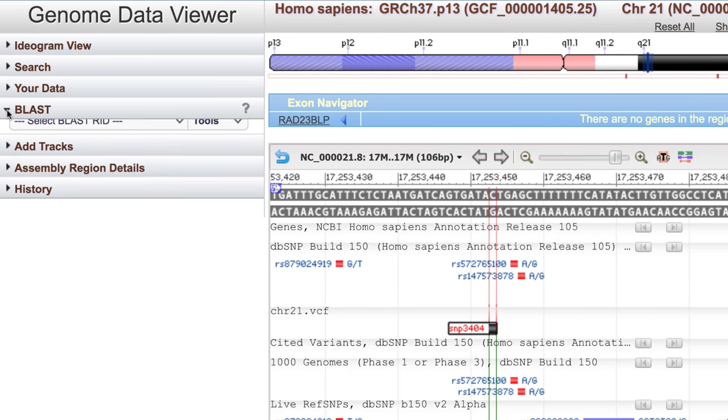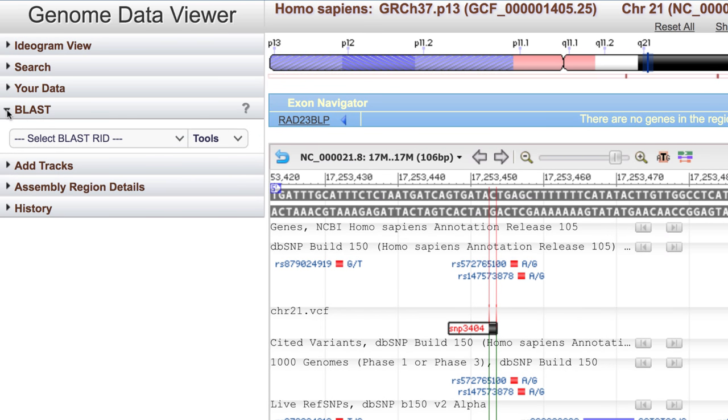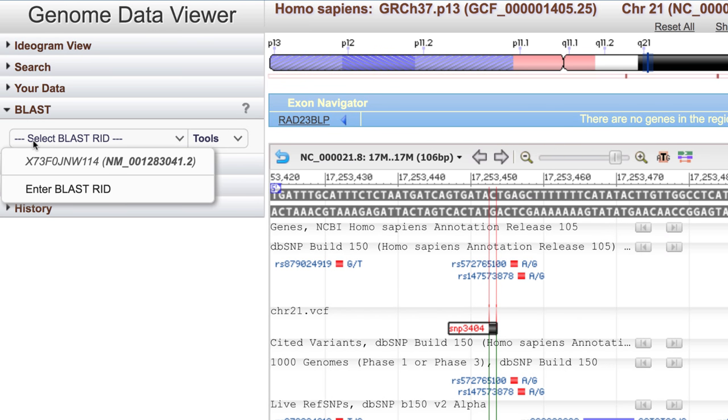We also recently added a BLAST function, allowing you to see recent BLAST alignments in the viewer.